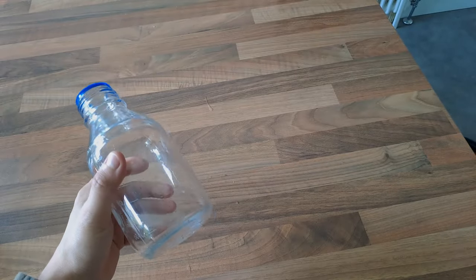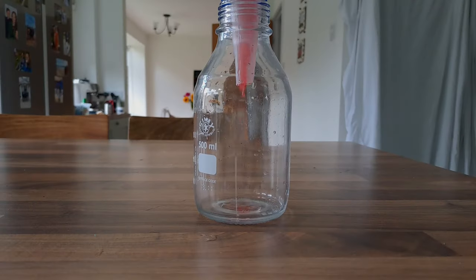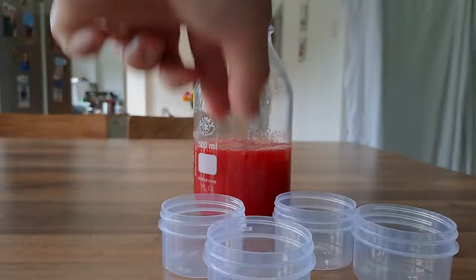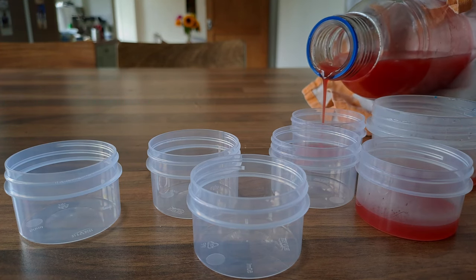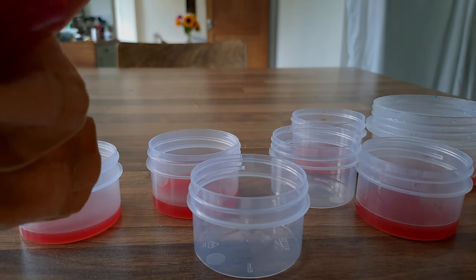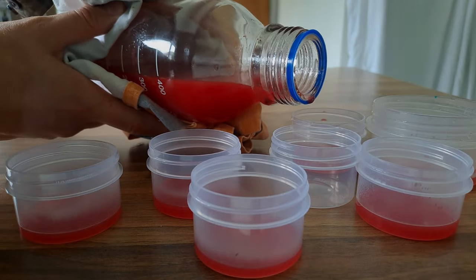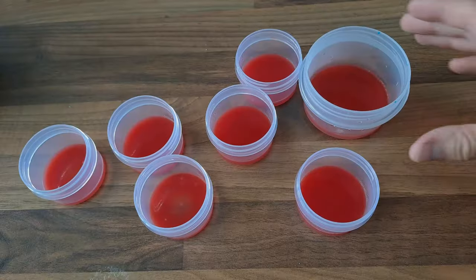I like to pour the mixture out into a lab bottle like this, as I can store it, sterilize it, and reuse it another time if I don't use it all in one go. Put the lid on the lab bottle and place it in the pressure cooker to sterilize along with the pots.